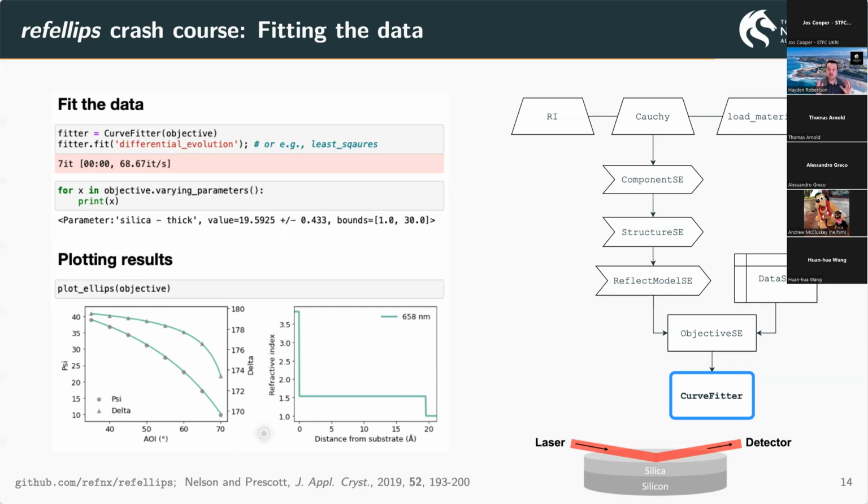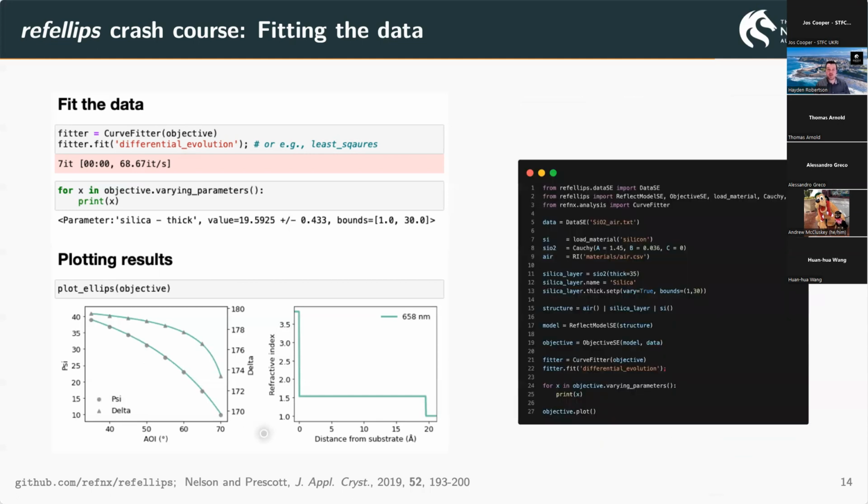Now I'm sure to everyone here, this doesn't look too bizarre, but in ellipsometry, it's not too common to actually see a depth profile for a refractive index. But this is just analogous to an SLD profile. And I guess the key takeaway is here we've got the mechanics to make these refractive index profiles. So all in all, in doing all of that, we only ended up needing this amount of code. So it was only about 20 lines of code. And the scripts are incredibly straightforward to set up. You can use any of the templates in the docs that we have to help you get started.